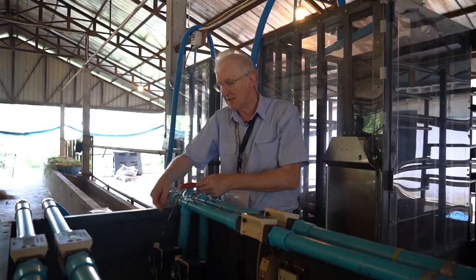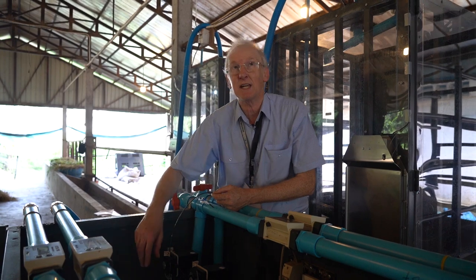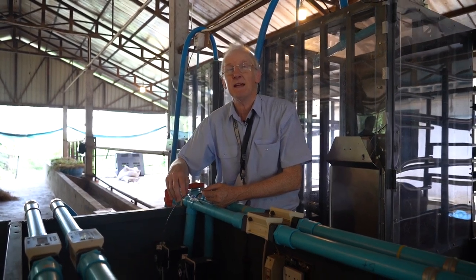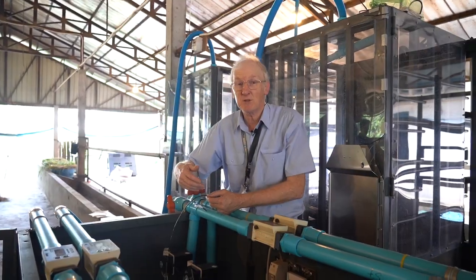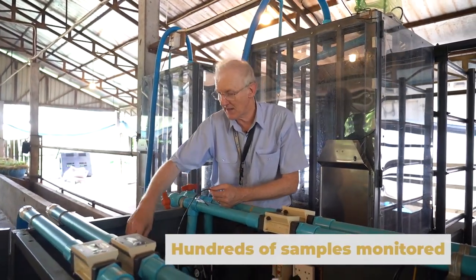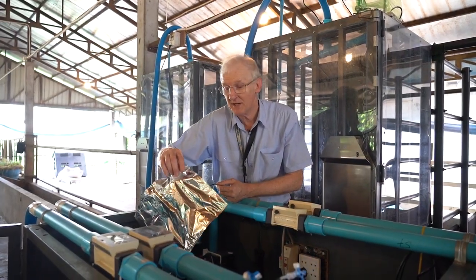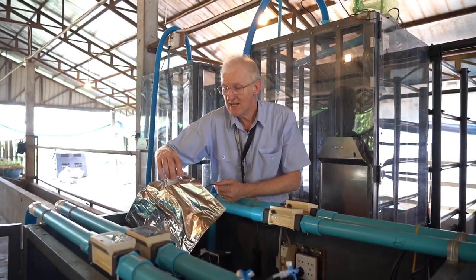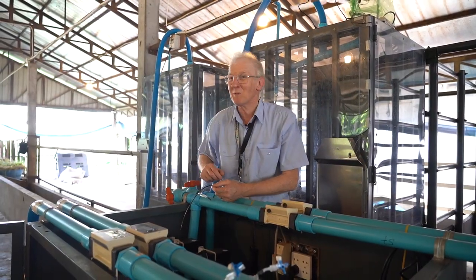So many people, instead of getting one gas bag to analyze, will get maybe 80 or 100 samples monitored over the time, and they will average that to get the average methane concentration, whereas we get the average methane concentration over the day by sampling one bulked sample. And I think I've probably said enough.